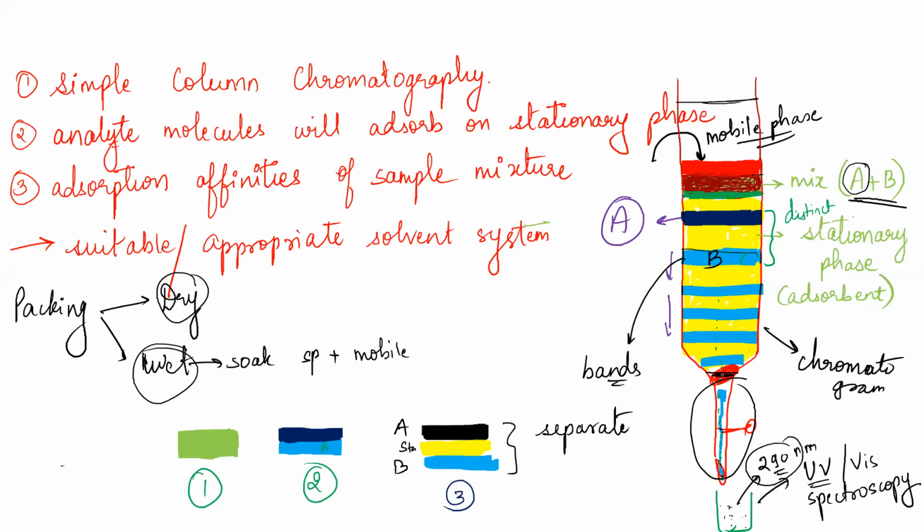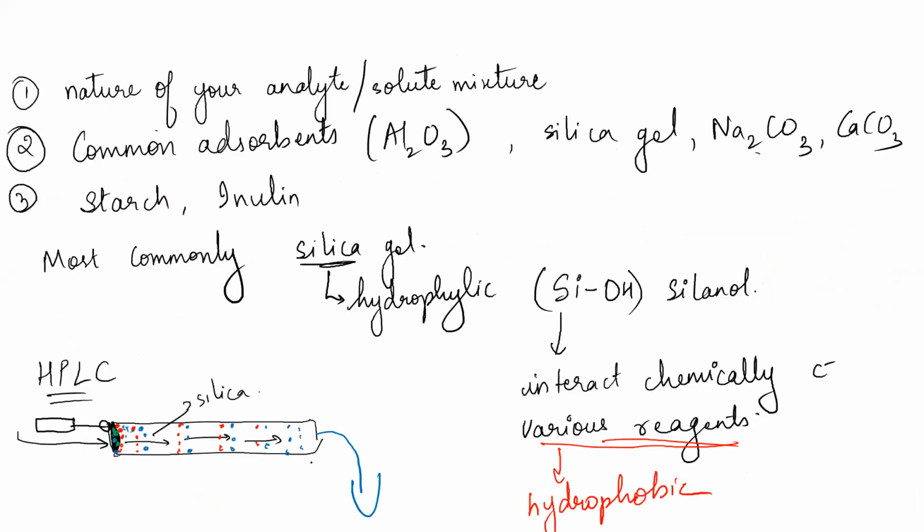Now it has a slight opening here which is attached to a small pipe, and here you can inject your sample and your mobile phase. So that is how an HPLC works. It's basically just like column chromatography, but a more sophisticated way. In glass column chromatography the outer container is glass. In the silica column packed in an HPLC, this is a hard metal covering, and this silica can be reused.